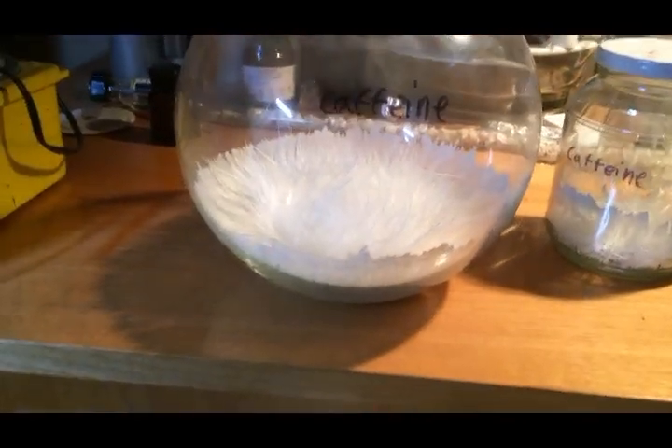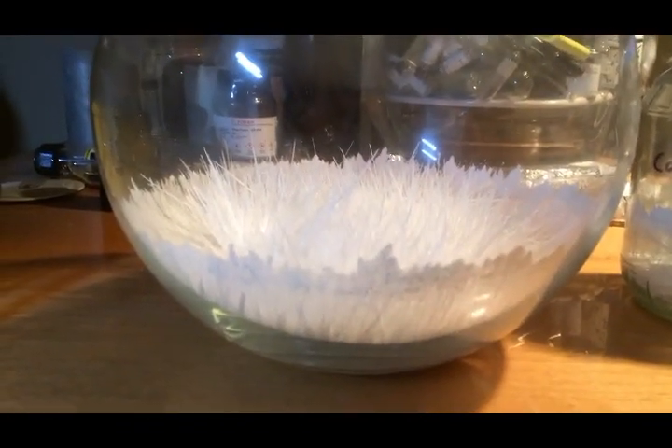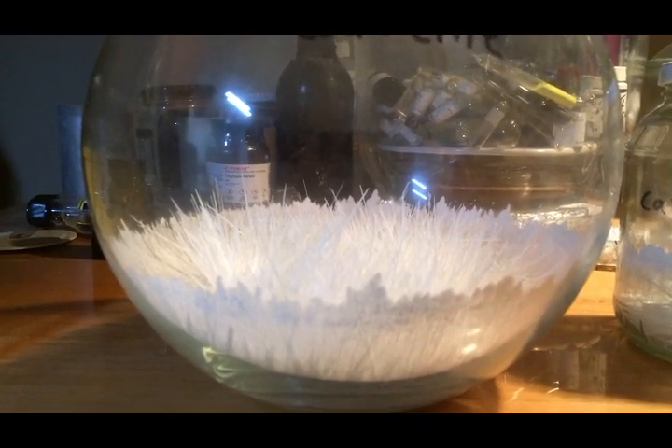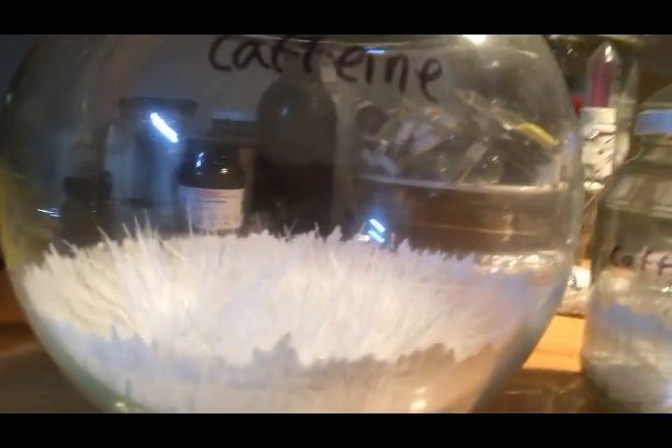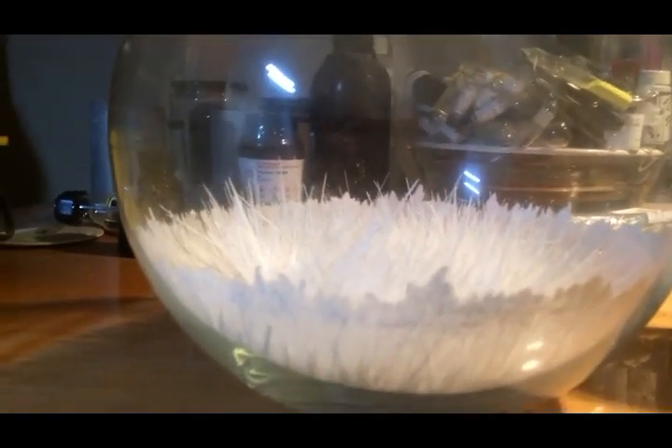It looks really cool so I figured I'd take a moment to show you how they turned out. Here are the two containers. The one I'm focusing on right now is by far the bigger one, but I think the crystals are actually a little less nice. The crystals in the other container are a little bit prettier, but these are still cool. I'm going to try and film in a way that really shows them off.